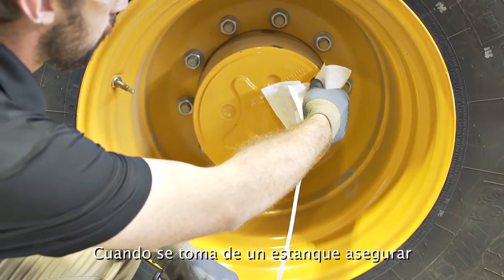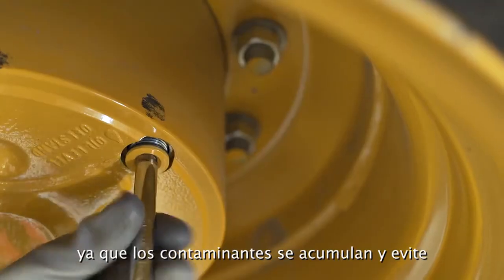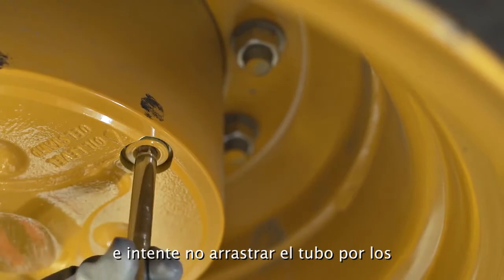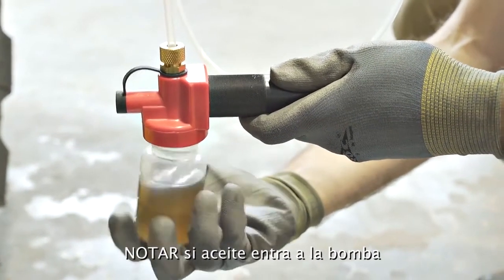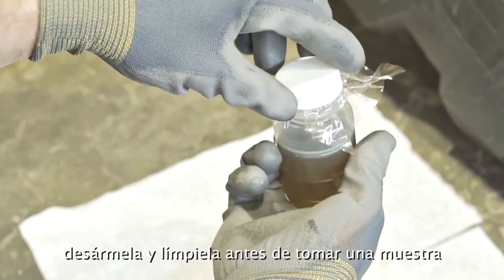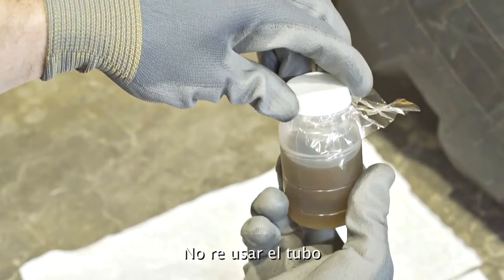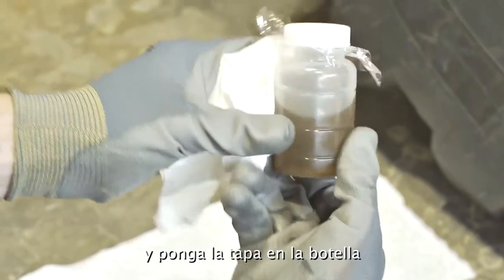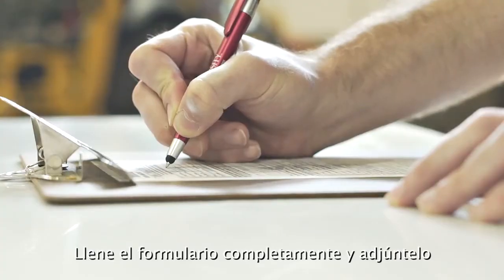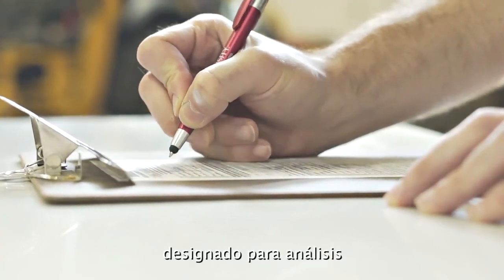When sampling from a reservoir, make sure that the sample is not obtained from the bottom of the oil compartment where contaminants accumulate, and avoid scraping the tubing along the sides of the tank or reservoir. Note, if oil enters the pump, disassemble and clean it before taking the sample. Do not reuse tubing. Remove the bottle from the vacuum pump and secure the cap on the bottle. Fill out the sample information form completely and submit the form and sample to the designated regional lab for testing.